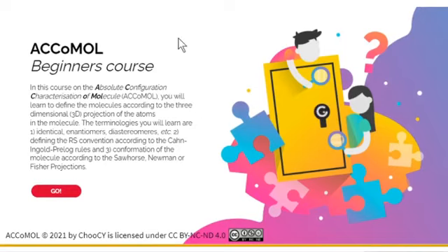Let us introduce to you the beginner's course of ACCoMOL. Altogether, there are 3 courses, but we will only show you the beginner's course, alright? So ACCoMOL stands for Absolute Configuration Characterization of Molecule.